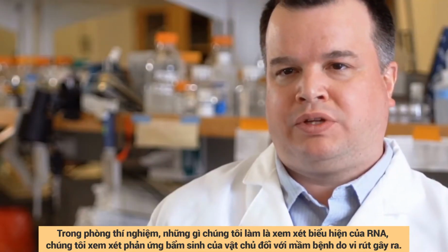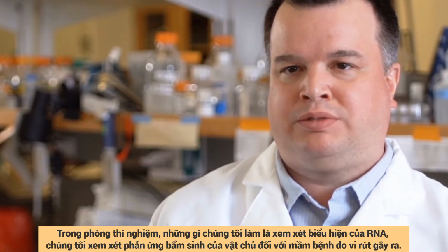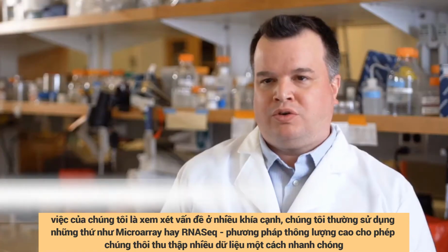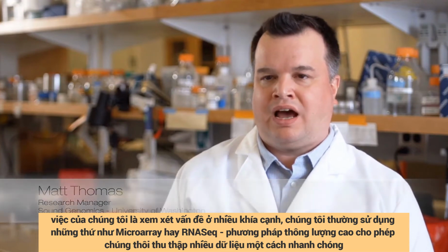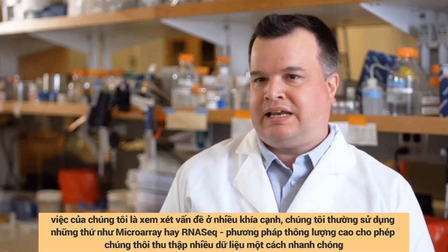Here in the lab, what we do is we look at RNA expression. We look at the innate host response to a viral pathogen. What we do is we look at that in multiple different ways. We usually use something like microarrays or RNA-seq, a high-throughput method that we can get lots of data quickly.